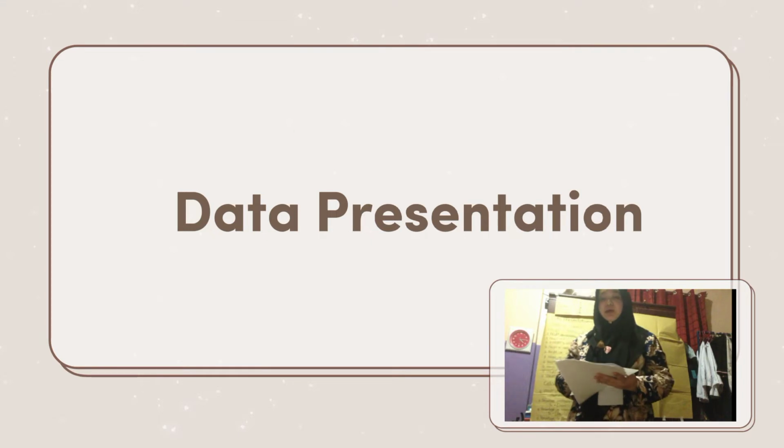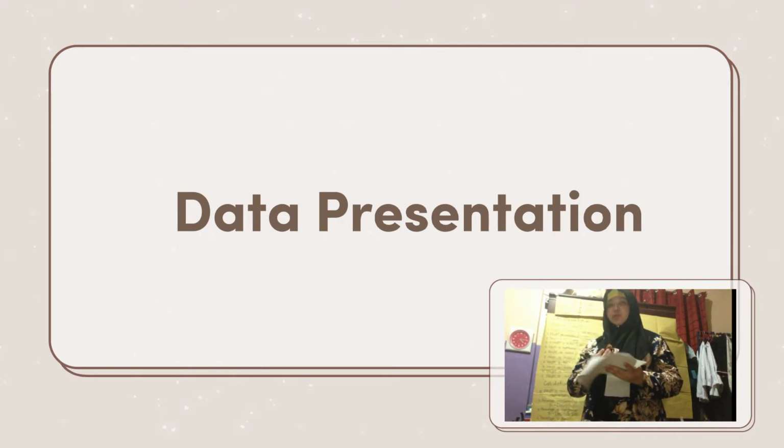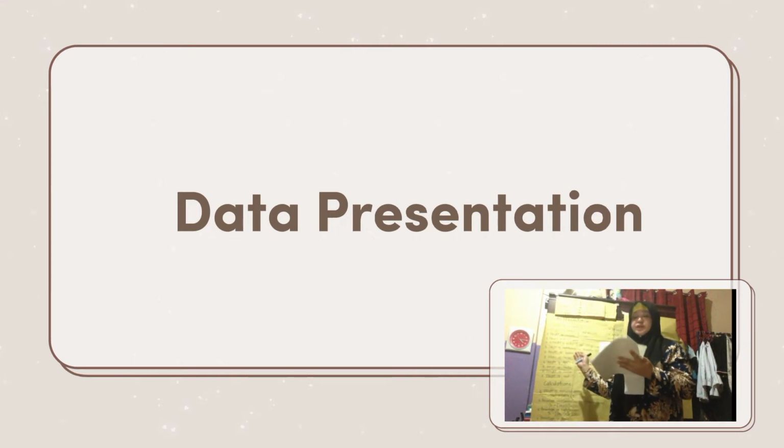Hello everyone, I'm Alinor Odasan and I'm from Group 2. I am tasked to report to you about the data presentation of our activity. Last Tuesday, we conducted our experiment with activities 2 and 4. So now, I will be using this formula to present the data to you, and we will of course know the percentage. First, I'll demonstrate what their corresponding weights are for this activity.